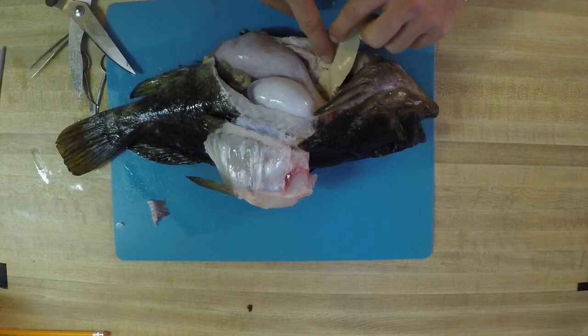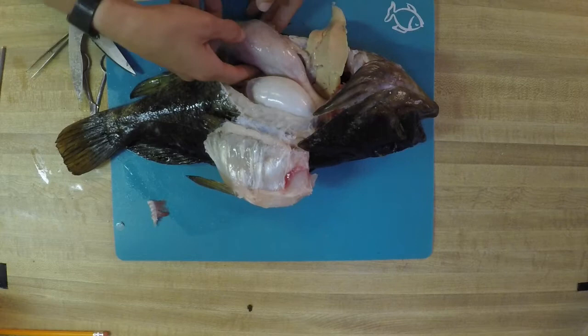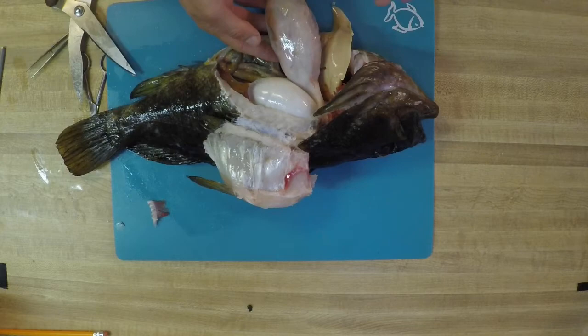Then we have this next major organ right here — this giant thing is a very, very full stomach. Same purpose as a stomach in your body — it's used for digestion and storing all the food you've just eaten. Then there is the very, very end of your intestinal tract — basically your lower intestines right here. This is slowly passing any kind of food that's already been digested in our stomach down through the body and towards our vent, where we cut through with our scissors in the very beginning.